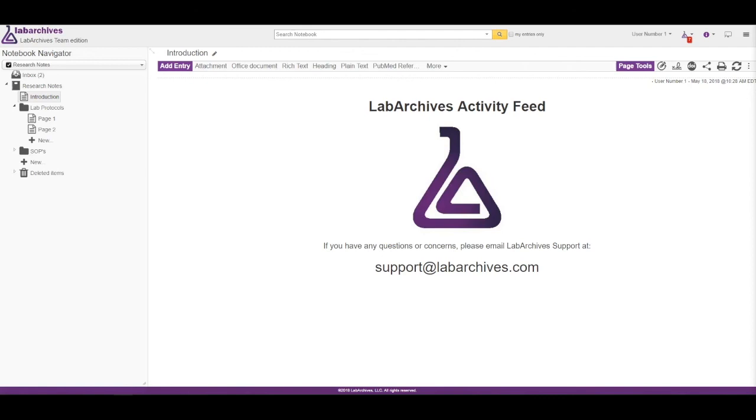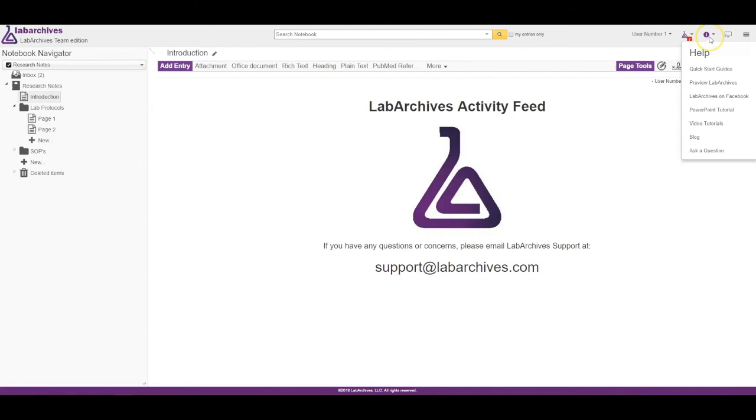For more information on the Activity Feed or other features, please check out our Knowledge Base, available at the purple icon at the top right, by selecting the word Help.